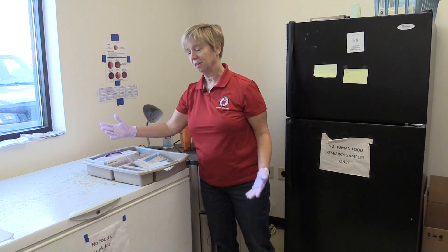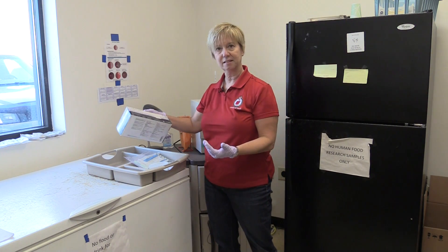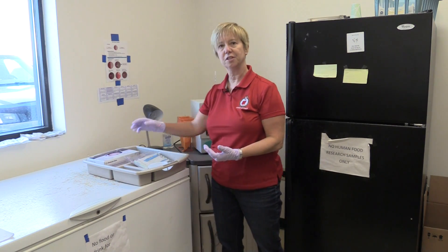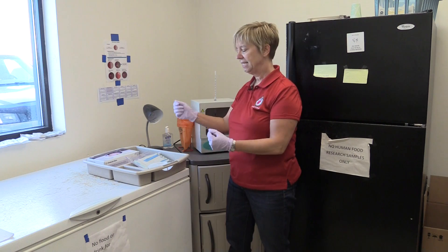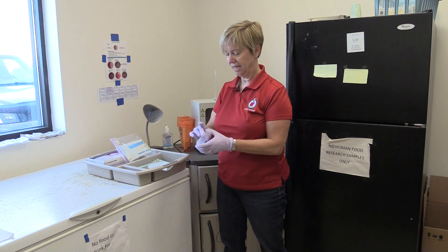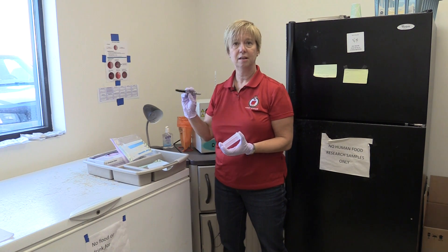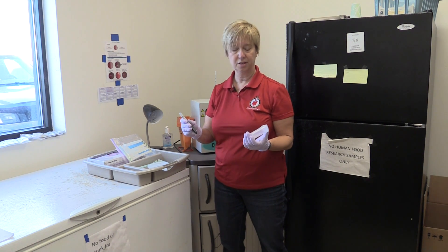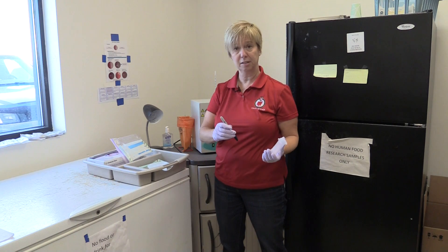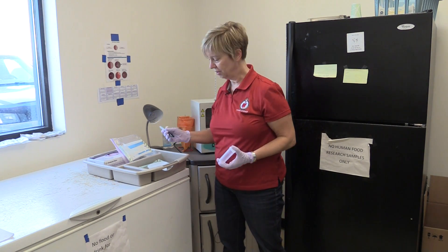A few of the things we need are gloves. Most farms have nitrile or latex gloves available, and we need to make sure that the person doing the culturing and setting up those plates actually wears the gloves and disposes of them after they're done. We also need to make sure that we've got vials available and an indelible permanent marker to make notations in the milking parlor of which cow, which quarter, and the severity score.